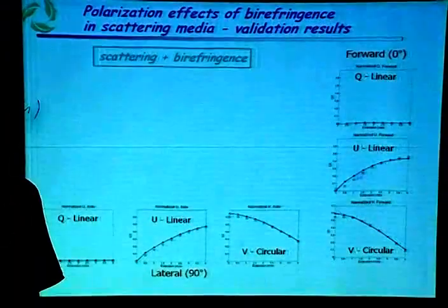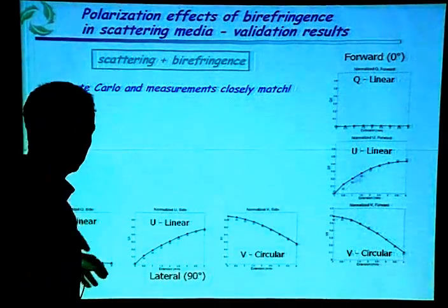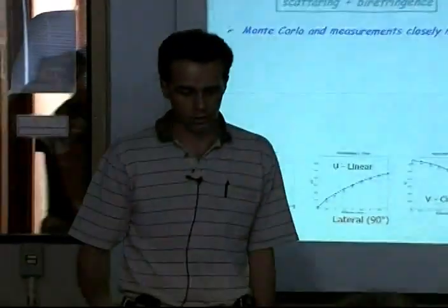And just to quantify the same graphs as what you saw before. This is actually our model, the solid line, and the green line is the measurements. So the match is pretty good. The agreement is fairly good.